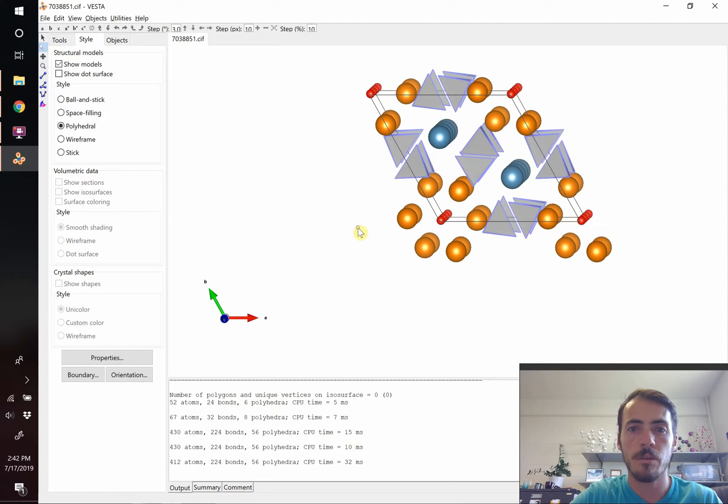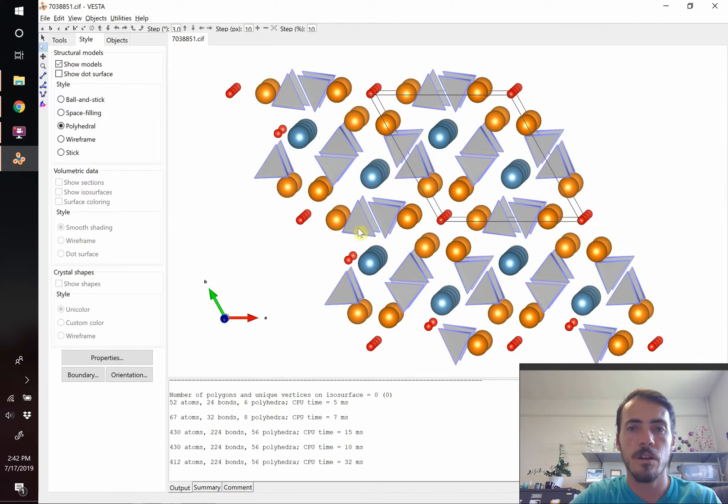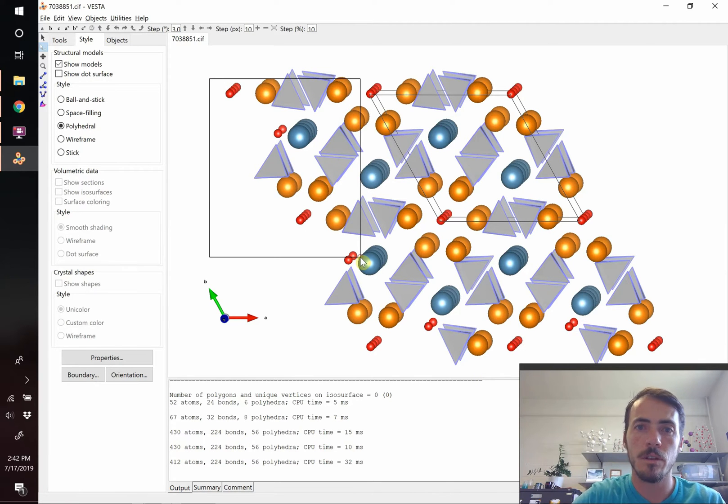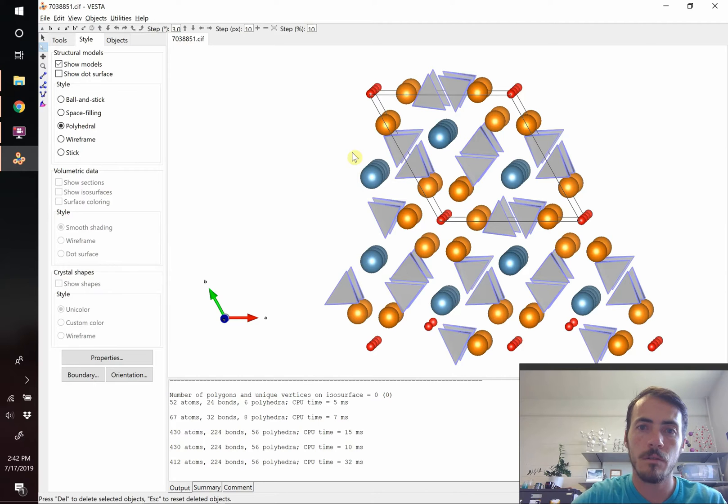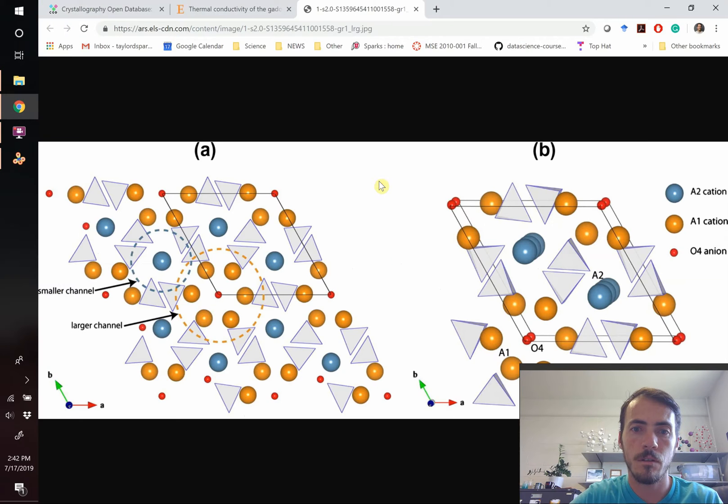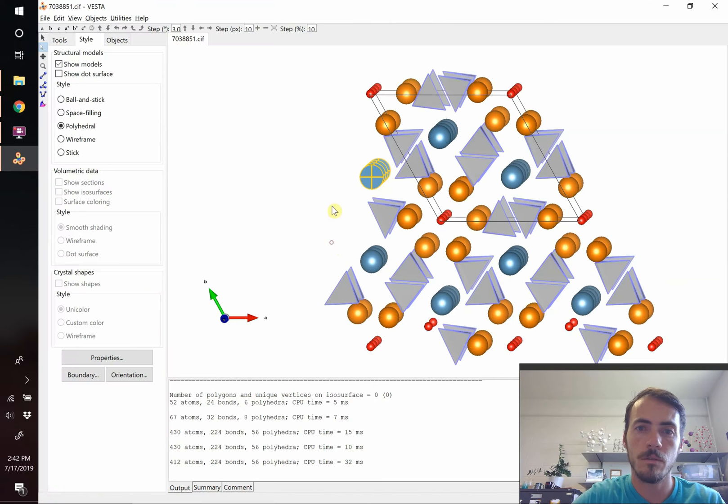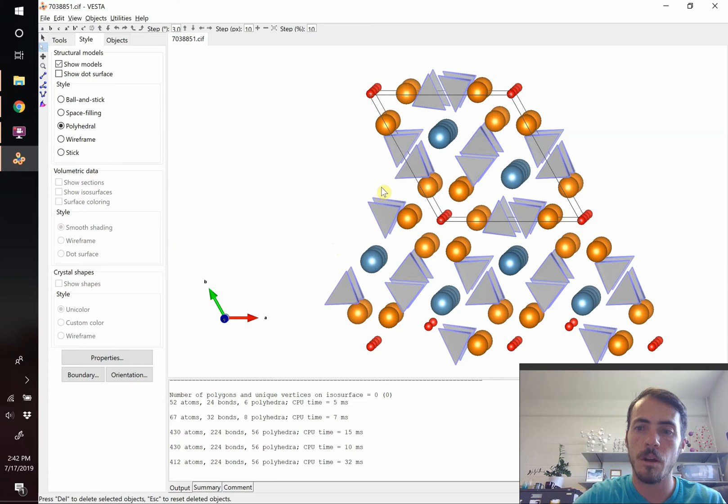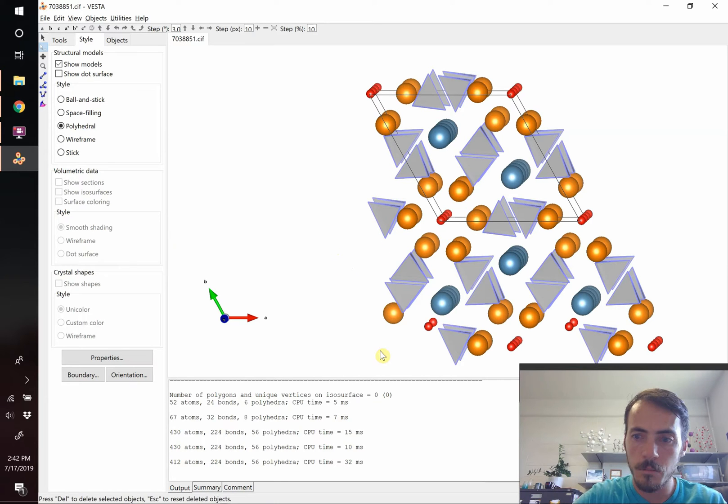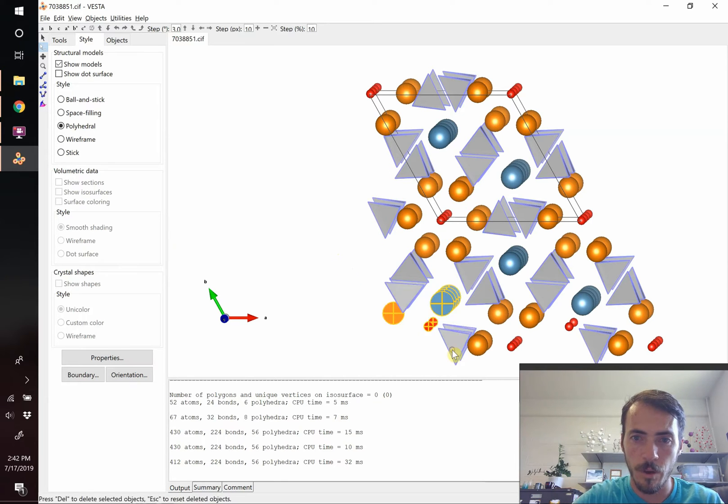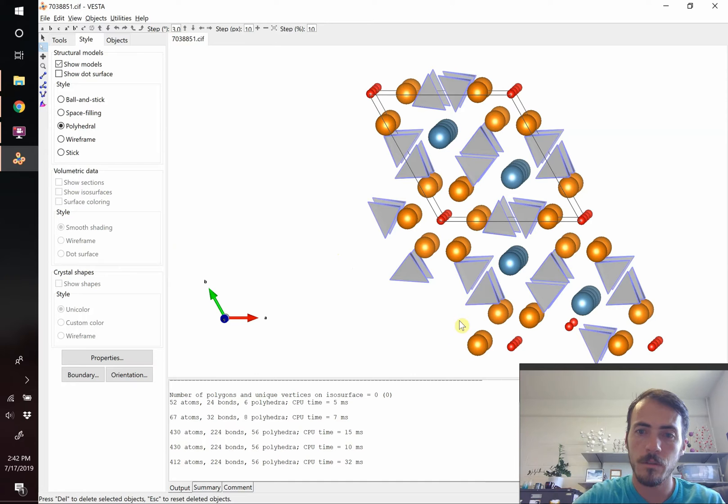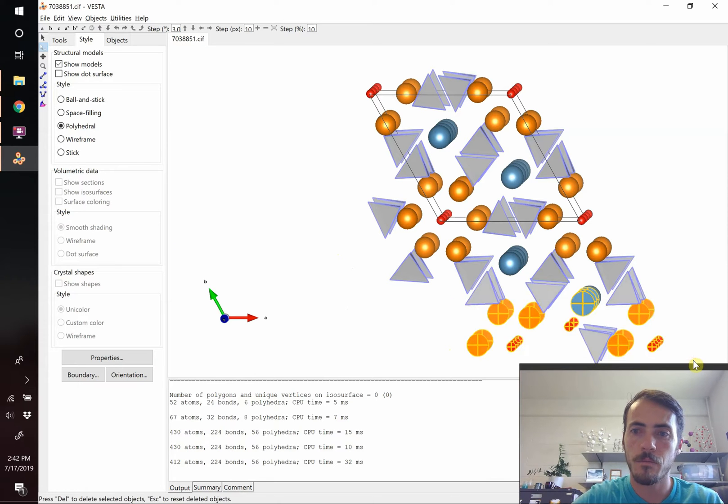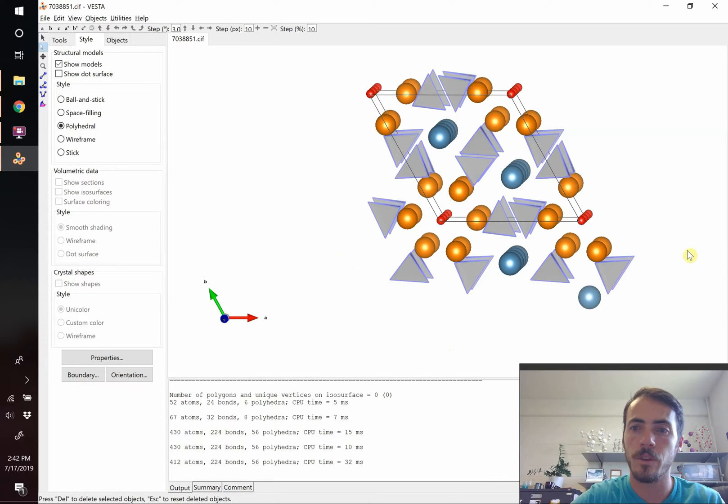We can just hit escape. Click on this, hit escape, and it brings everything back and it gives us a chance to try it again. So let's go ahead and do that again, delete these, we deleted those, let's grab them, hit delete. And I'm going to keep the polyhedra this time that surround it, just to reproduce that figure.